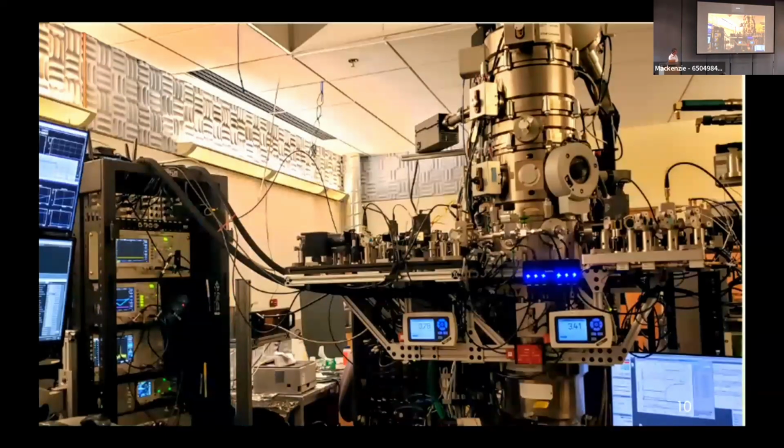Okay, this is what it looks like. The column at the center is a FEI Titan microscope. That's a brand name. On the left-hand side, we attach a breadboard to shape the laser beam. It then enters the microscope column here. The cavity is inside the microscope column because we wouldn't get the resonantly enhanced beam through viewports. They would just attenuate it too much, right? And then the spent beam is analyzed on that side to monitor the health of the cavity and run some feedback loops to keep it aligned.